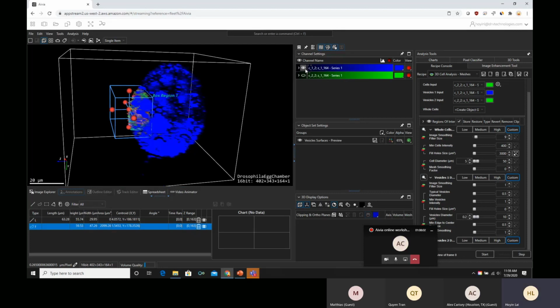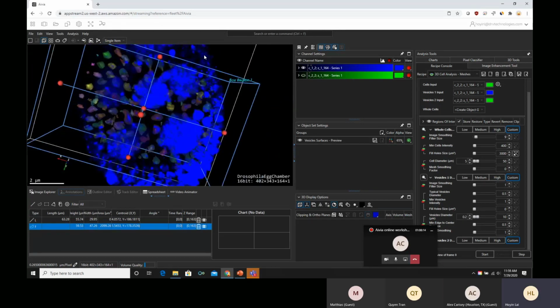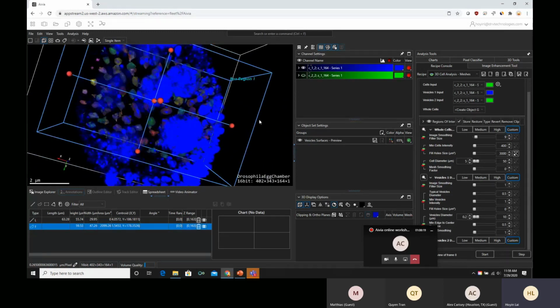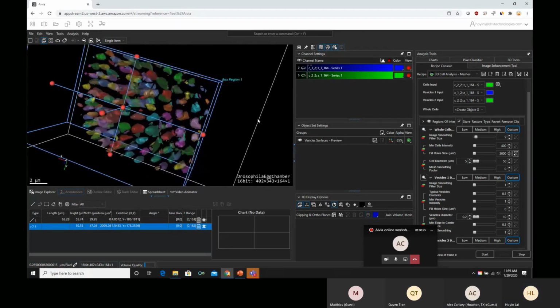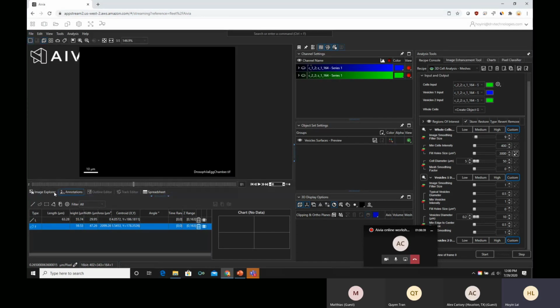So remember that the parameter determination and everything that we've done is going to be based on the processing step that is already applied to this image. If I look at this, you can think the cells actually look pretty nice, I believe. Let's see. Let's turn on. So it is doing a little bit of extra partitioning, more partitioning than I wanted to. So I'm going to go back to the 2D view and try to measure out how big each of these nuclei are.